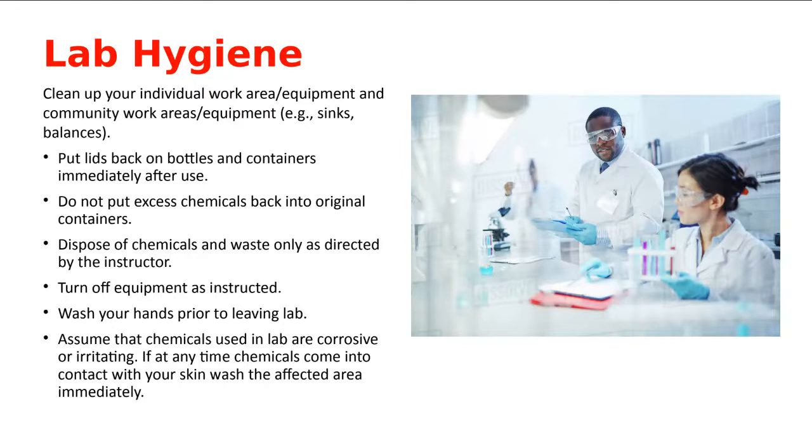Okay. When we work with dilutions, we're going to be working with potassium permanganate. That stuff is really light and it's purple and it goes everywhere. But if you get more than you need, you do not put it back into the container. You just simply throw it away. Okay? Dispose of chemicals or waste as instructed by me or by our lab technician. His name is Keith Crippen, and he'll be in the lab with us, and he'll direct you, or I'll direct you for where you need to put the waste. Okay?